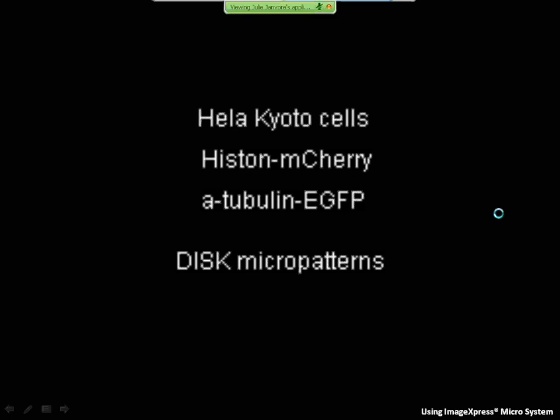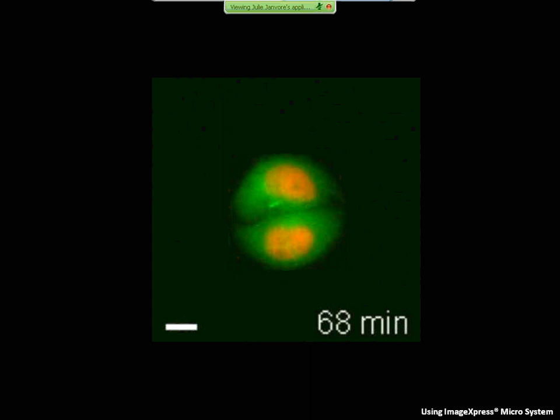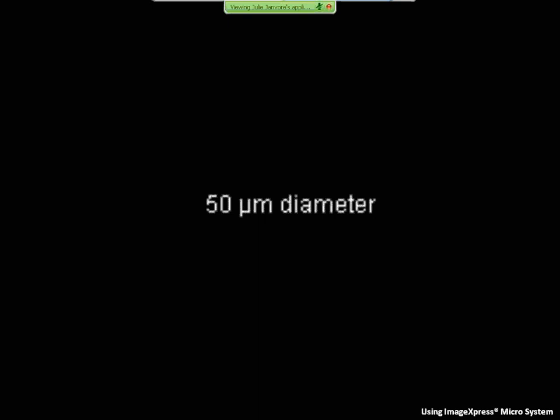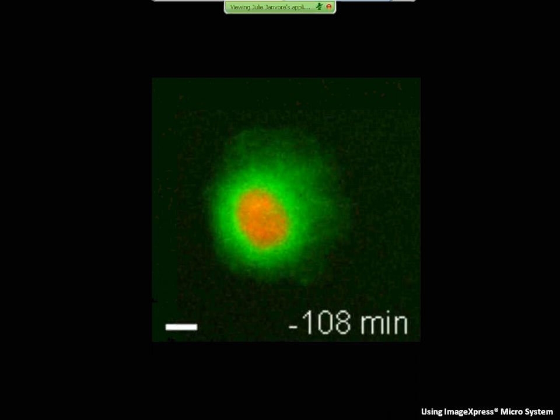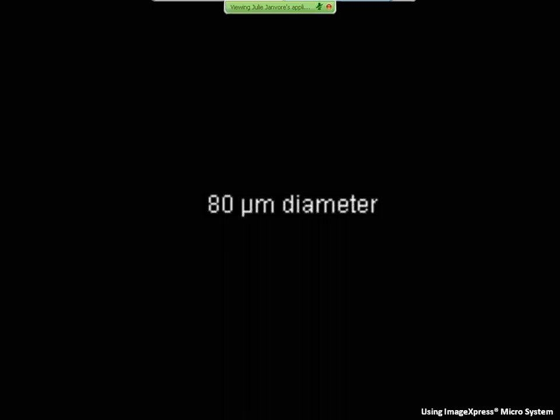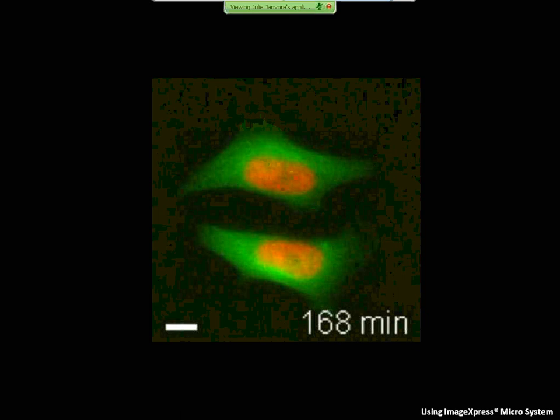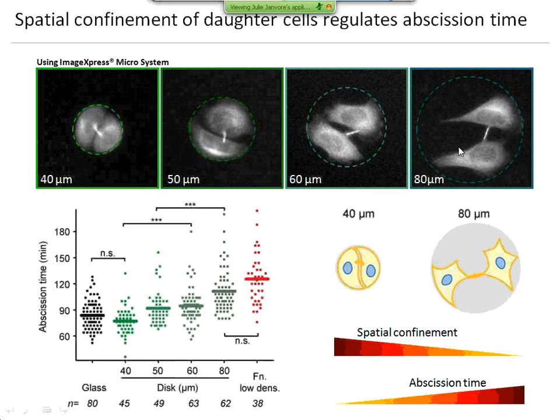To get rid of this confounding parameter, I used micropatterned surfaces — disks of different sizes to control specifically the space that the total cells have and to avoid any cell-cell contact with neighboring cells. On a very small disk, the mother cell covers the whole disk and the daughter cells are very confined. On a 15-micron diameter disk, the daughter cells have a bit more space but are still confined. On bigger disks, the daughter cells can move almost freely. I quantified the abscission time and showed a gradual increase in abscission time with increasing disk diameter, meaning the important parameter was spatial confinement — when cells are less confined, abscission takes longer.